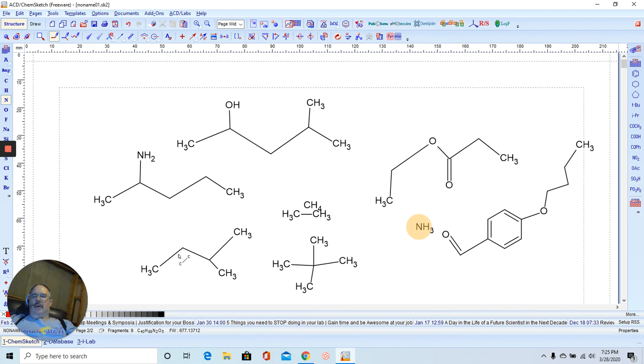If we had our NH2 here, there's no way we could have our two CH2s. Okay, so here we have our two CH3s. Also, we would have three CH3s, which is not what we have.